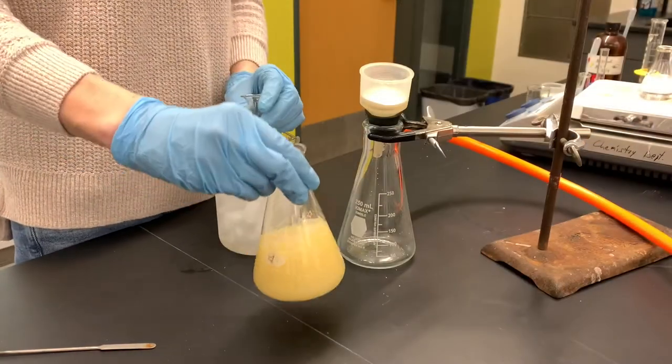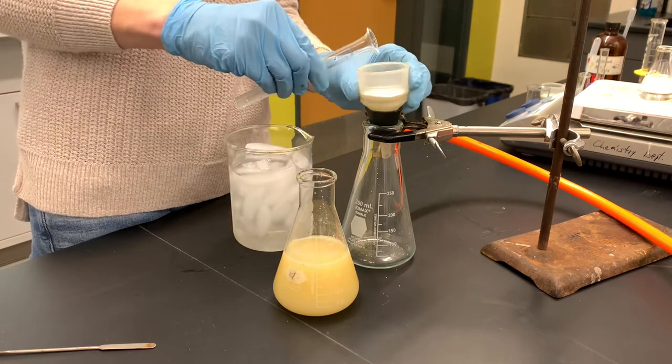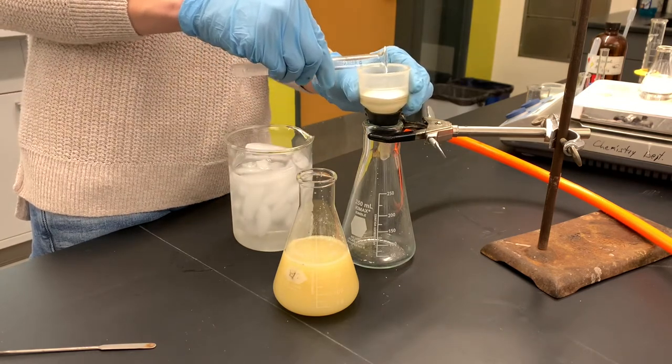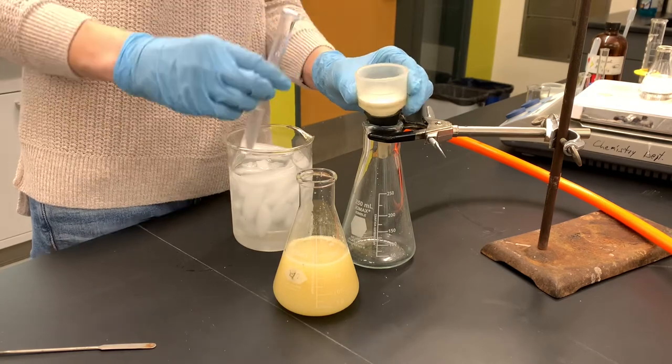Okay, we're gonna filter this. We're gonna be rinsing it with some ice cold water that I've had chilling in here for a while. I'm gonna start by getting the filter paper a little bit wet. Get that water.